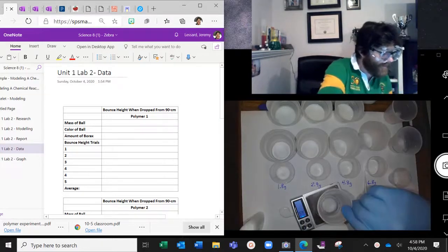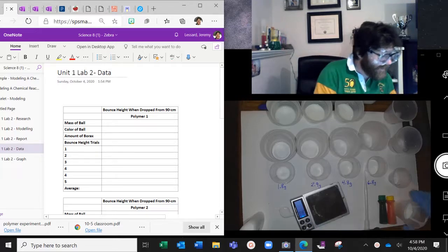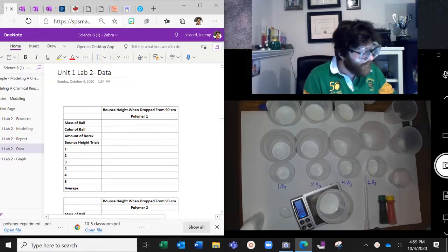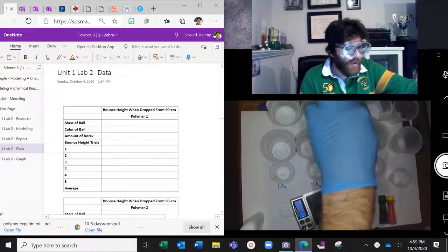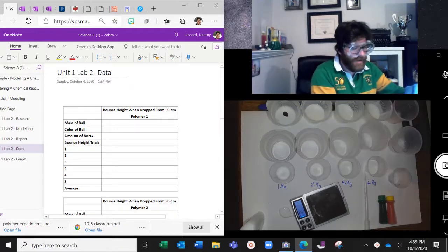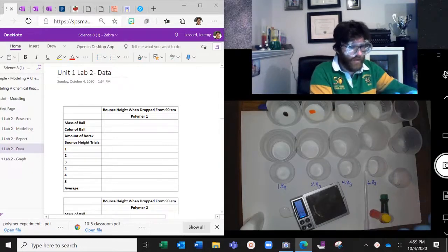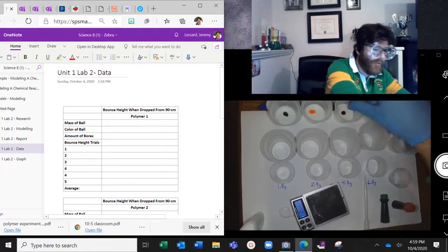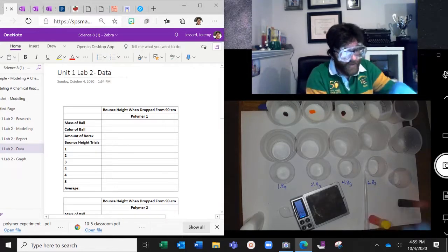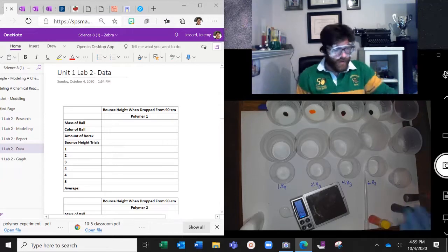Alright, so as you can see, I'm just going to zero out the weight of the cup. And I've weighed out just about 20 grams of glue in each of these cups. I'm going to color them, 2 drops each. Okay. And this one is going to have 1 red and 1 yellow, and hopefully that'll be different enough we can keep track of them. And we'll have 2 green over here. Boom, boom.